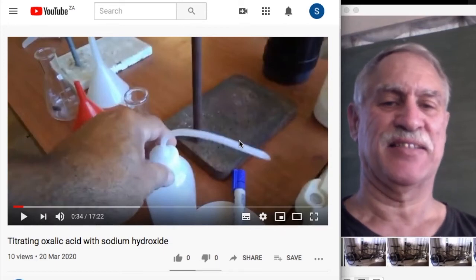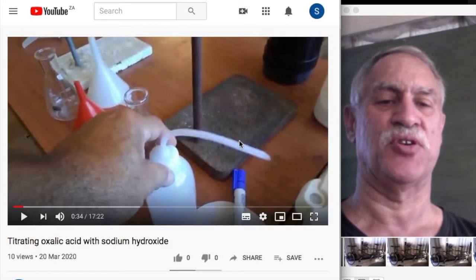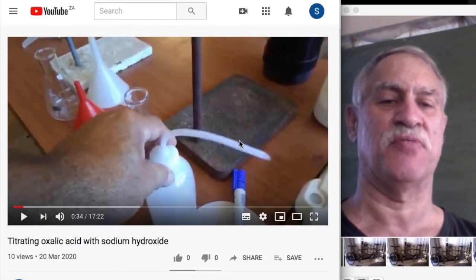Hi. Sometime back I did a titration of oxalic acid with sodium hydroxide. Let's just have a look at part of that video.